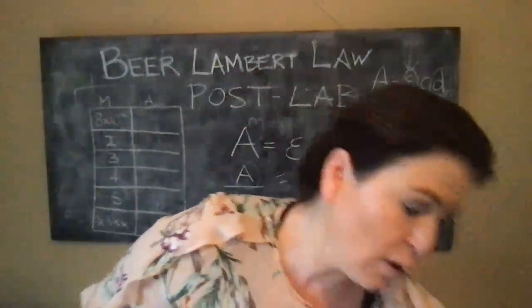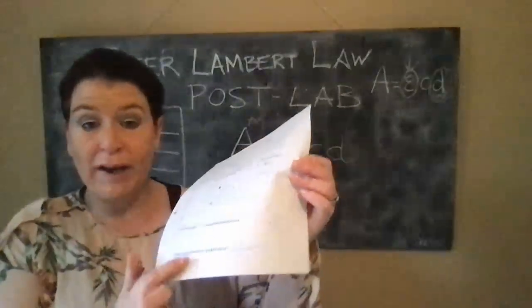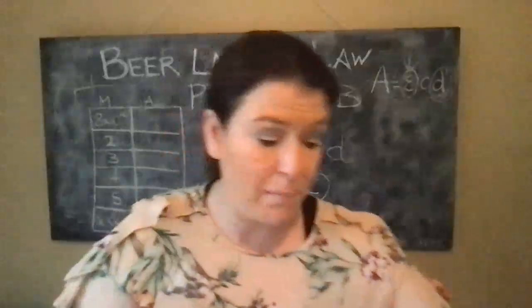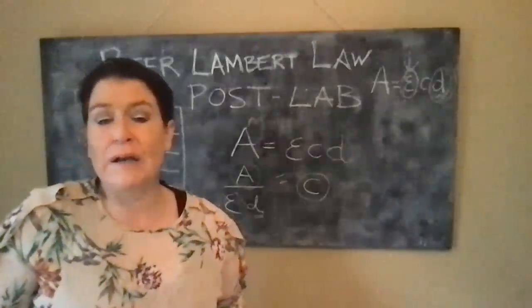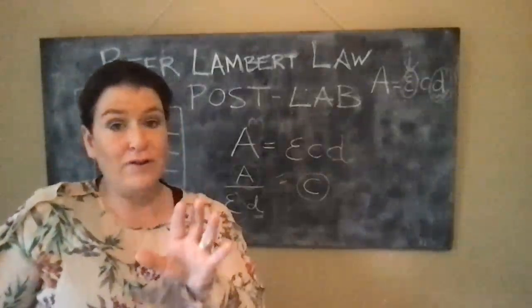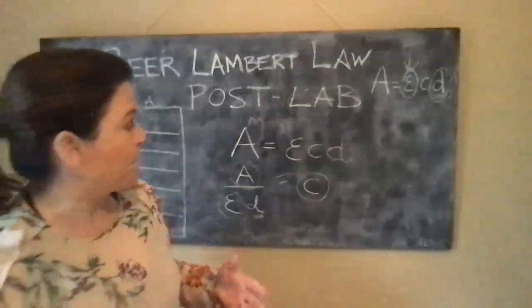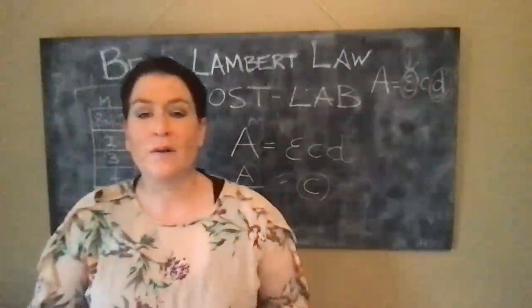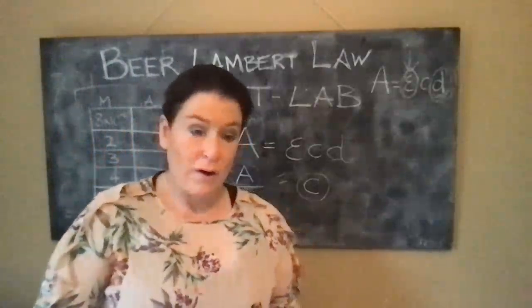You need to present your results in a raw format like this, ensuring you do not leave the lab without a signature on the bottom of your data. And remember that data is the data that needs to be included in your graph that goes in with your report. If it doesn't, there's something fishy going on, and we'll consider it some sort of plagiarism. So your report, and then the final questions. A little bit of a conclusion: how successful your experiment was.